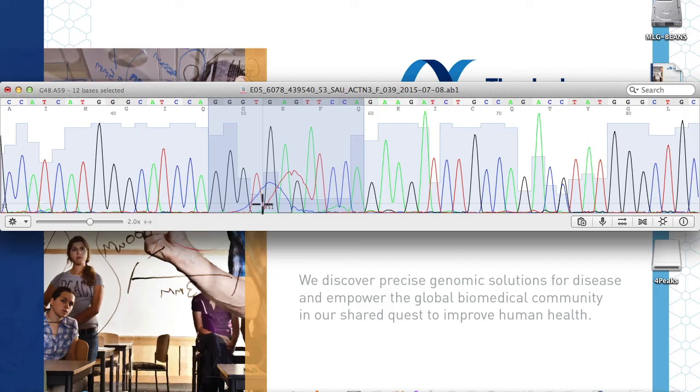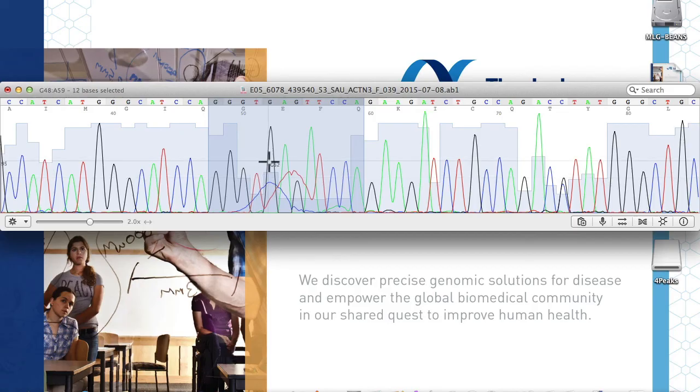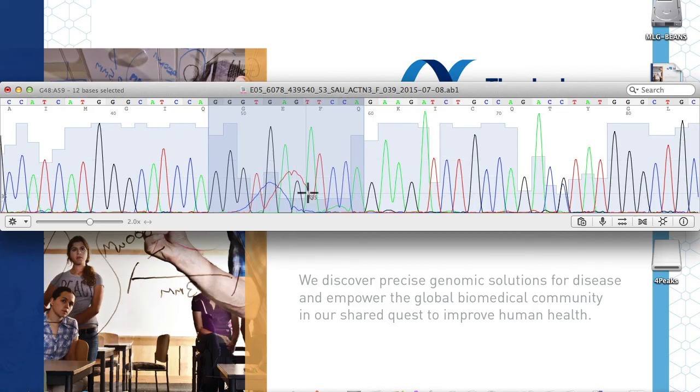As we visually inspect through the artifact, we can check the calls above made by the software. G, G, T, G, A, G, and here is an error. This T call by the software is really supposed to be an A.